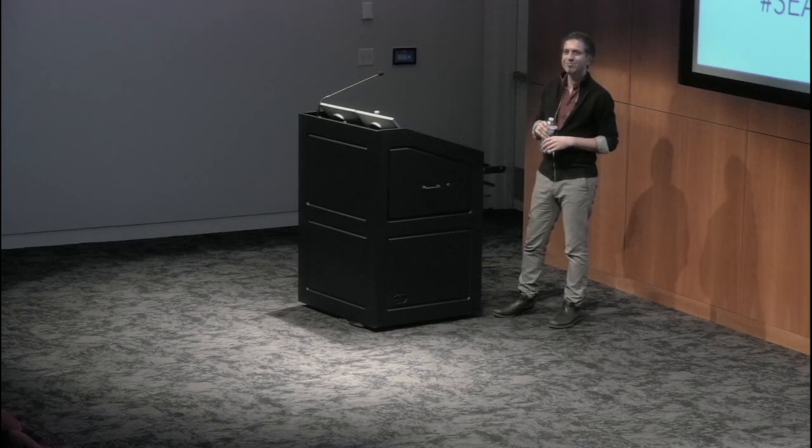Thank you. Do you foresee the ability to multiplex CUT&RUN with other techniques such as RNA-seq in the same cells? I think you certainly could do that. We haven't actually done any work on that. We're more interested in multiplexing for different chromatin proteins. But I think, yes, especially with strategies that use barcoded reagents, that would be particularly appealing, actually, on the single cell level.